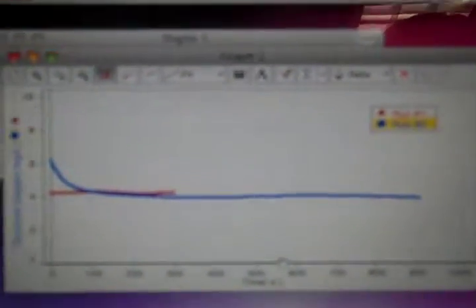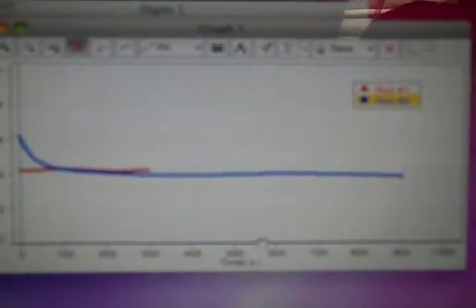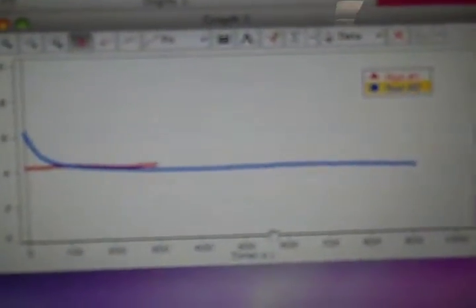Our results are the graph as follows. The blue line indicates the dissolved oxygen. It decreases as time goes on because the plant is releasing its oxygen into the environment. Results occurred because the lamp shined down on the plant, which caused the plant to absorb the energy of the light, thus having to release oxygen.